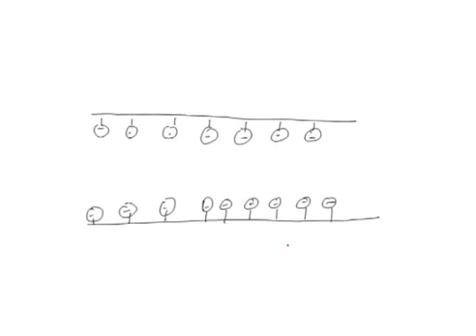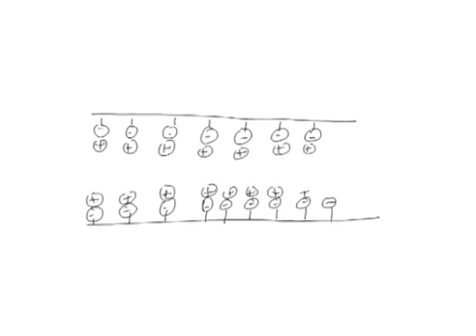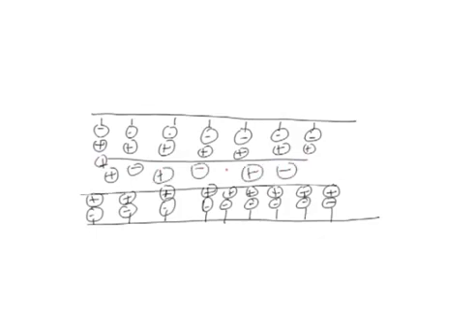Now, there is a particular electrolyte in the capillary, say a free solution you are utilizing here. The solution inside this capillary will carry both positive and negative charge. Now, what will happen? This positive charge will be attracted towards the negative charge here. So, on the inner side of the wall, a layer is created, which we call a double layer of negative and positive charge. Positively charged ions from the electrolyte move towards the negatively charged wall. Then there are other positively and negatively charged ions in between here.